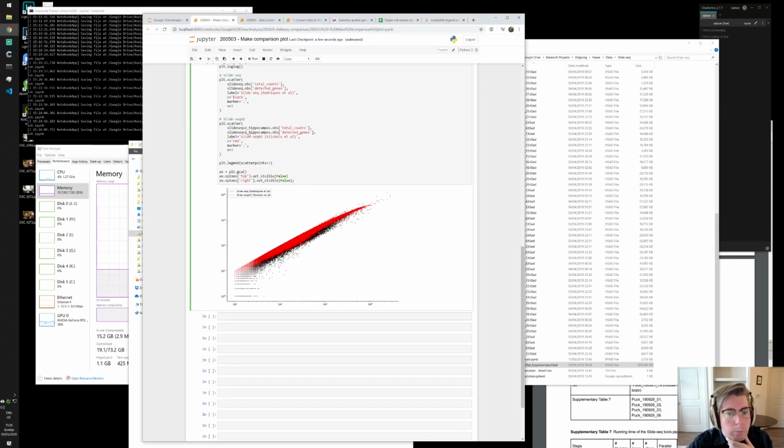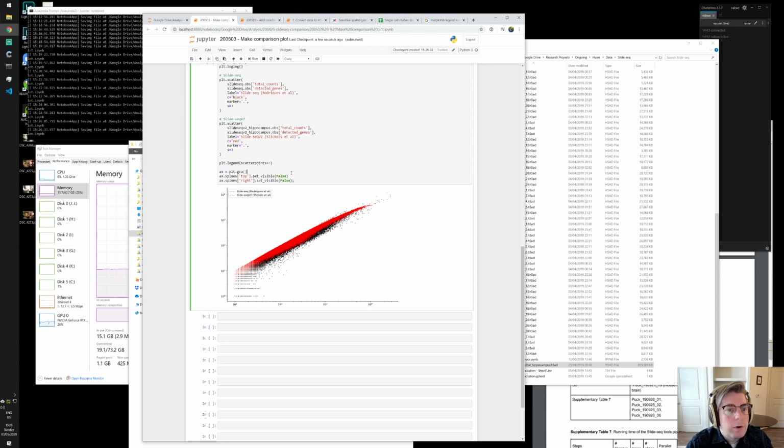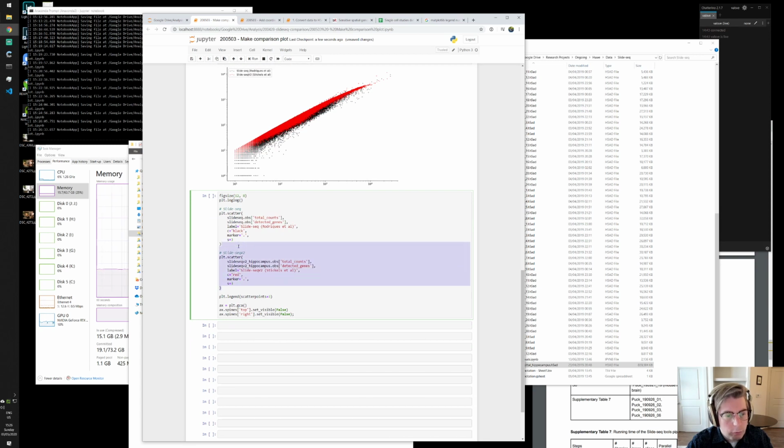Yeah, you might be able to argue that Slide-seq version 2 is kind of on top or like above values for Slide-seq. But actually what I will do is I'll make the same plot again after this, but just sort it the other way around.